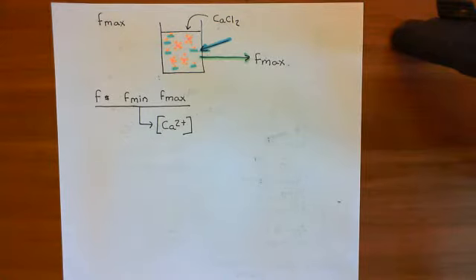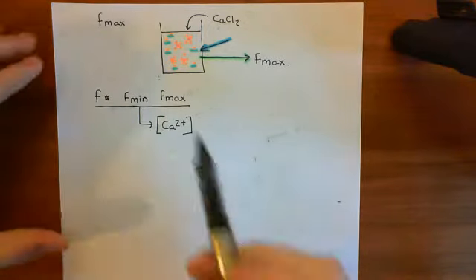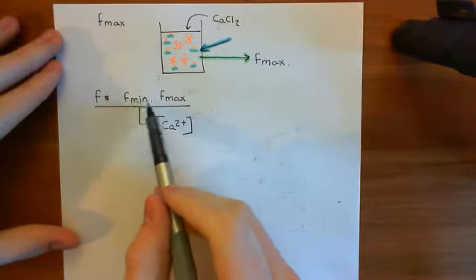That means we have the absolute minimum fluorescent properties that we could have for that concentration of Fluo-4. We then shine blue light of the same intensity as before at this solution, and we'll get less intense green light coming back. We will measure the intensity of that green light, and we'll call it Fmin.